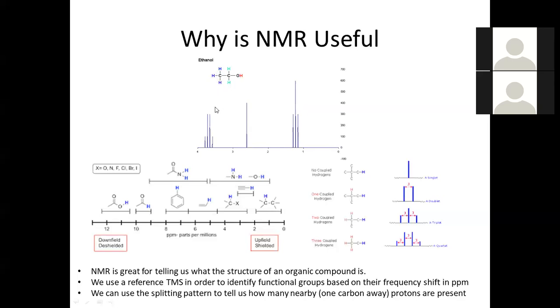You can think of them as coming off the methyl like that, right? So they're all equivalent hydrogens. And similarly, the two on this carbon are the same, and we have this hydrogen that's not like any of the others. So we have three different groups of hydrogens, right? So we would expect 3 peaks in our NMR, and that's actually what we see, right?